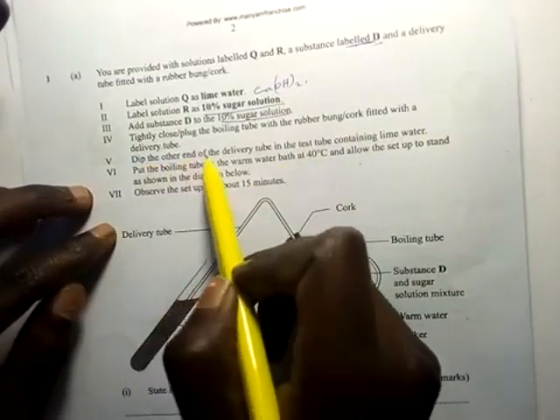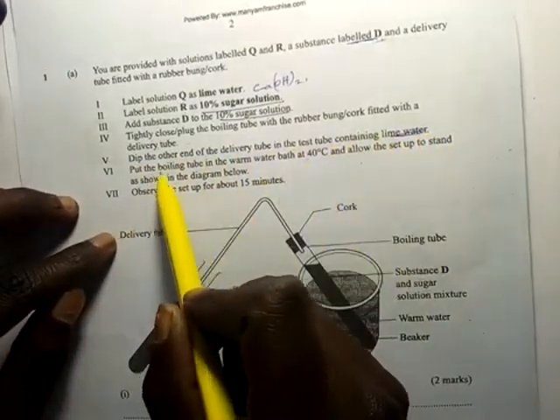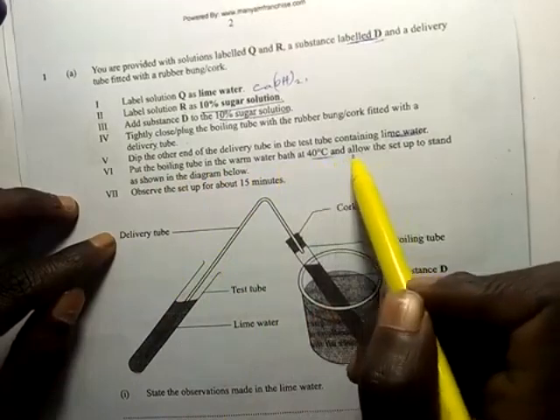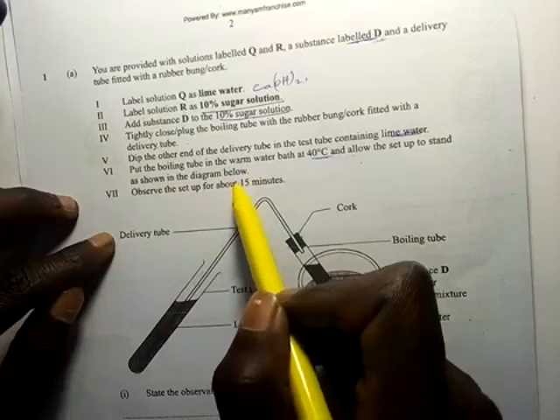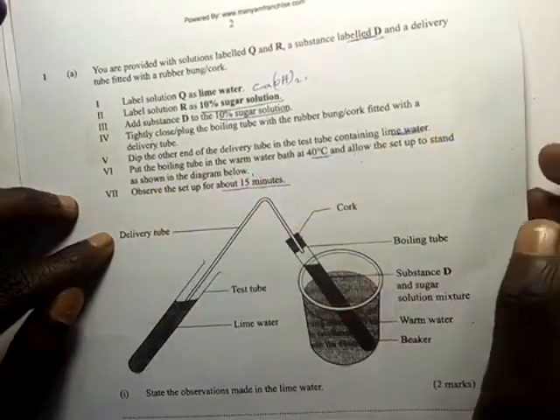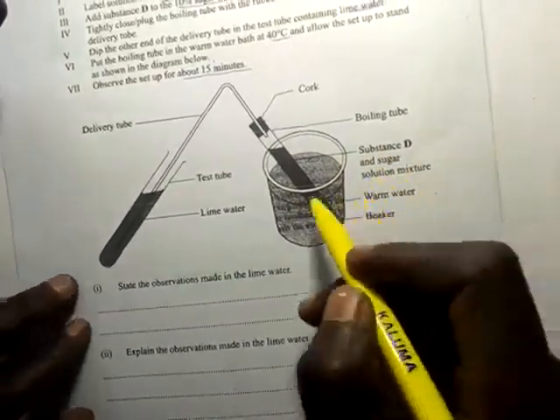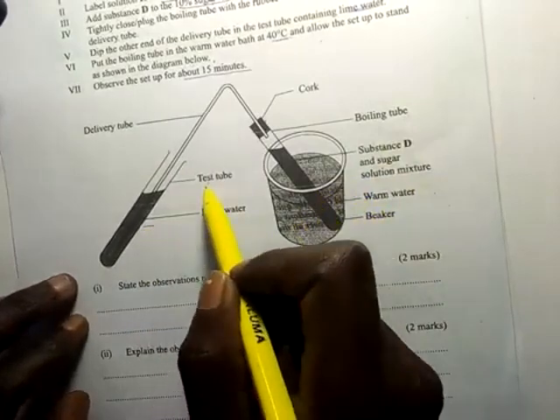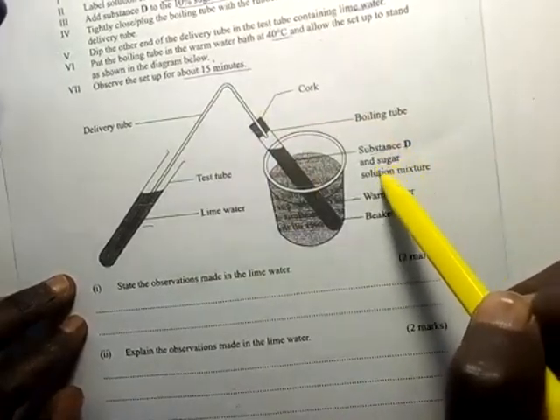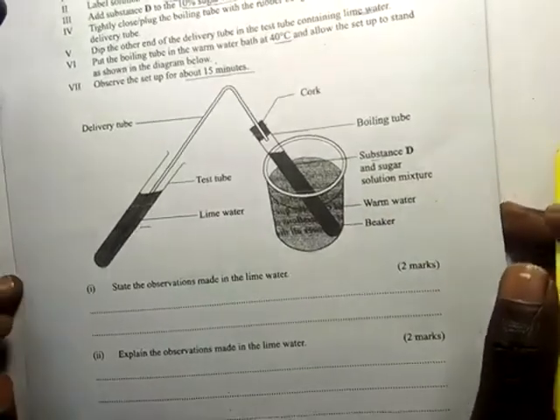And then dip the other end of the delivery tube into the test tube containing lime water. Put the boiling tube in the warm water bath at 40 degrees Celsius and allow the setup to stand as shown in the diagram below. Then observe the setup for about 15 minutes. Now the setup was looking like this. So you can see this is the lime water, the test tube, delivery tube, cork, substance D, and the sugar solution mixture under the water bath of 40 degrees Celsius.